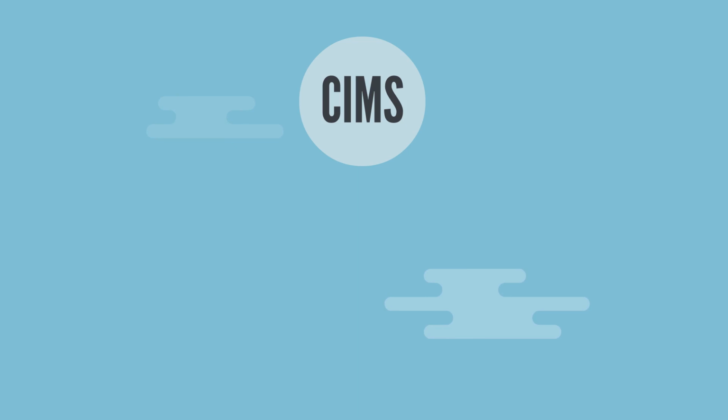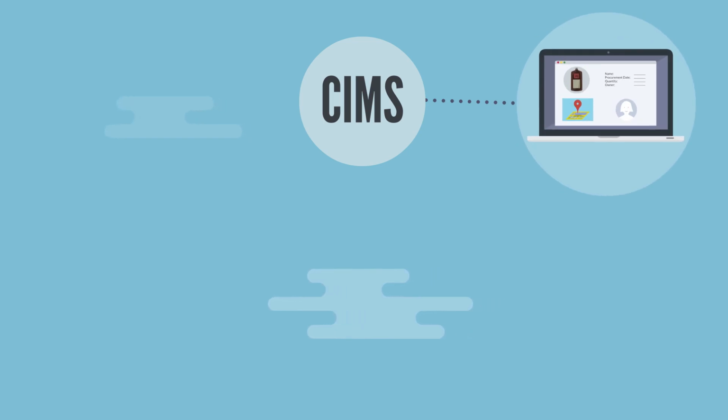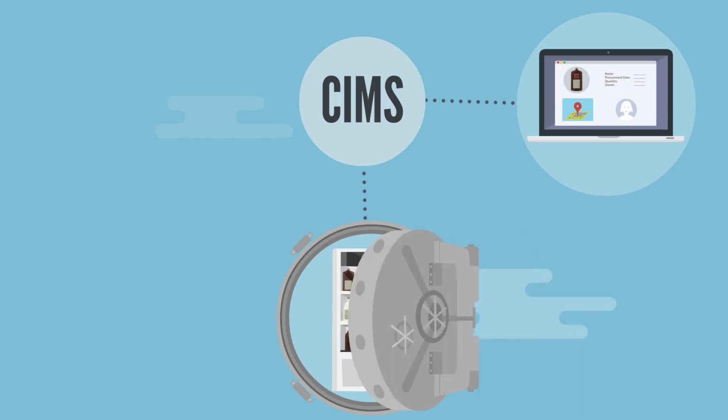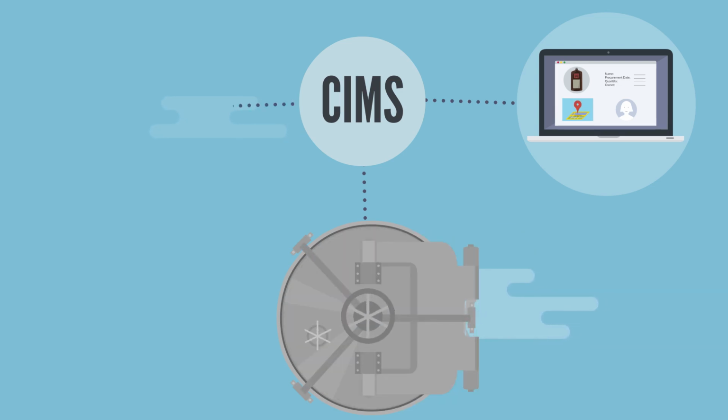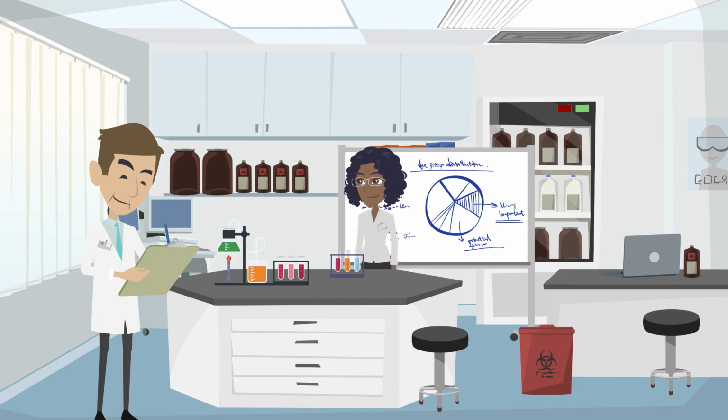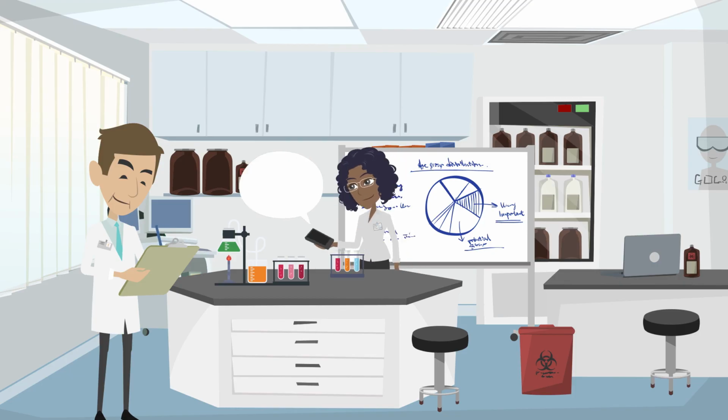Let's recap. A successful chemical inventory management system requires 3 major considerations. First, that a living database of chemicals is regularly maintained with relevant, detailed information. Next, that access to information and assets, both for insiders and outsiders, is carefully controlled. And finally, that chemicals are designated an accountable owner, and that employees are trained for maintenance, inspection, and regulatory compliance tasks. This system will ultimately reduce chemical risks and make your facility safer, more functional, and more secure.